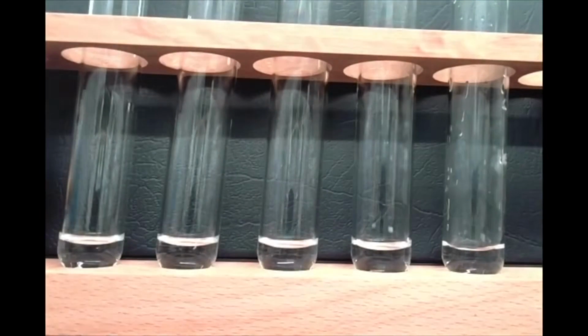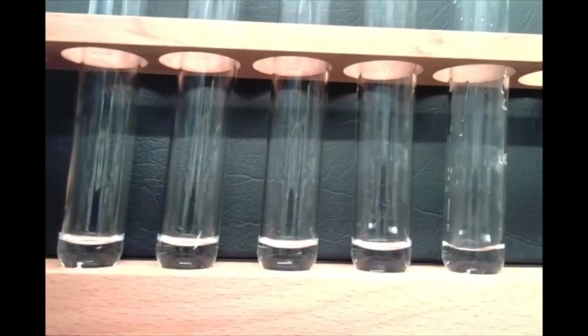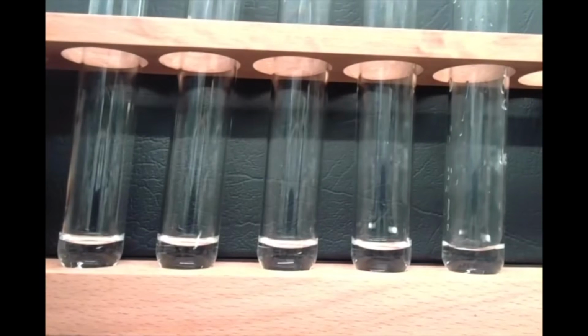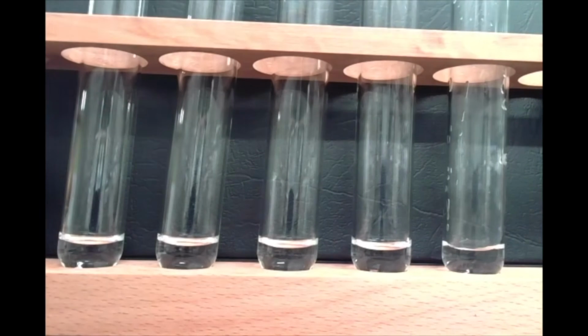Okay. So to the second test tube over here, we're going to add a little bit of our manganese(IV) oxide. Let's go ahead and add a tiny spatula tip full of that, and we'll get to observe some of that reaction.